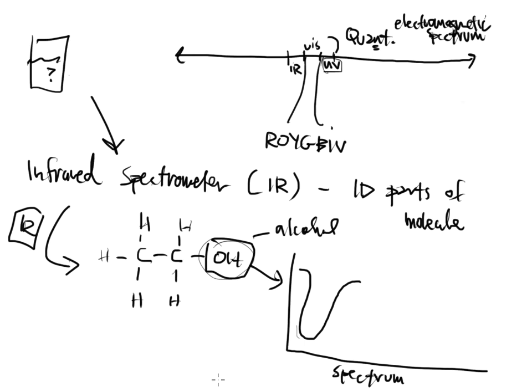Here we have an instrument. It doesn't really identify a molecule. It identifies an OH group. So if I ran propanol or isopropanol, the question is, would it be able to distinguish the difference? So this is propanol. An extra carbon's been added, but it's still an alcohol, right? So it still would show up with this big hump.